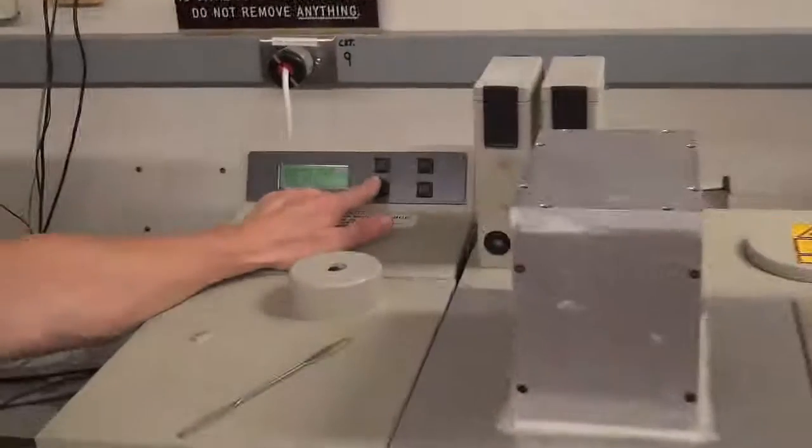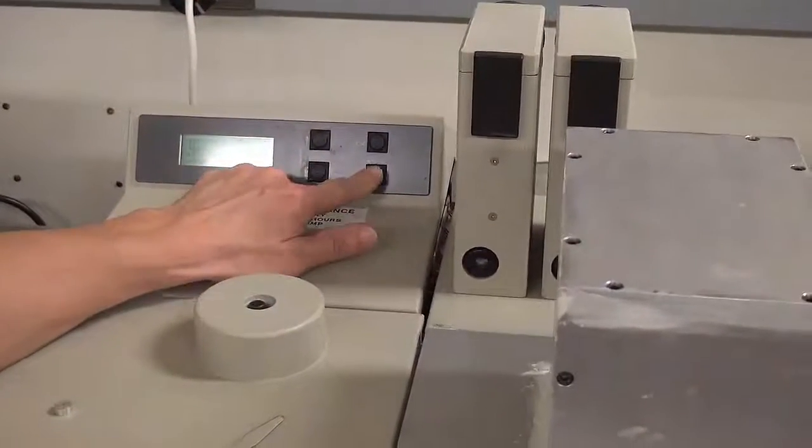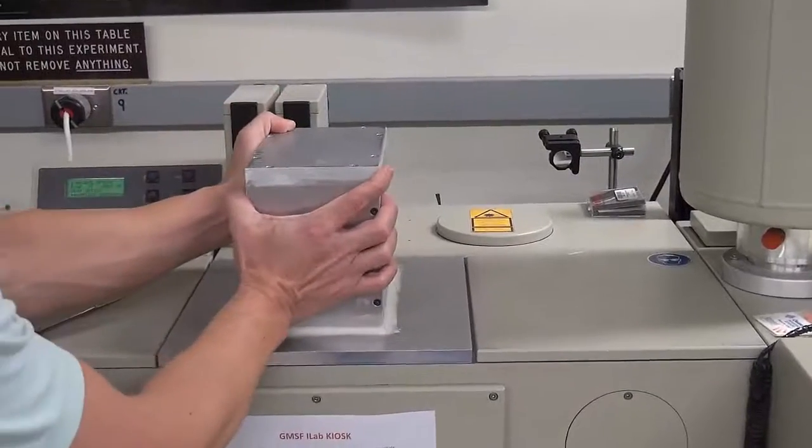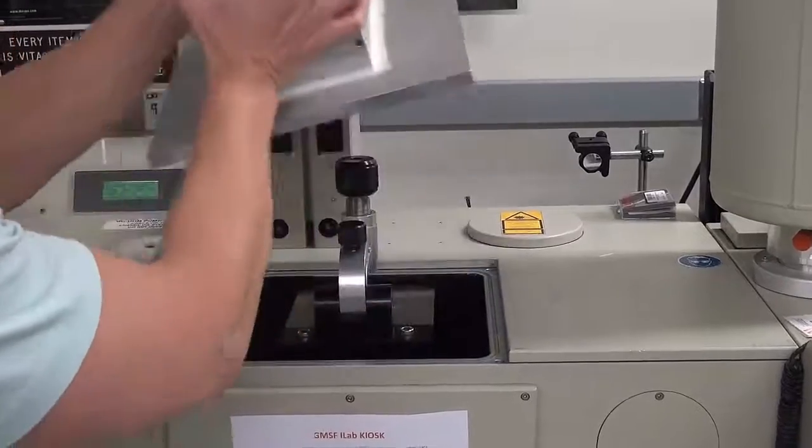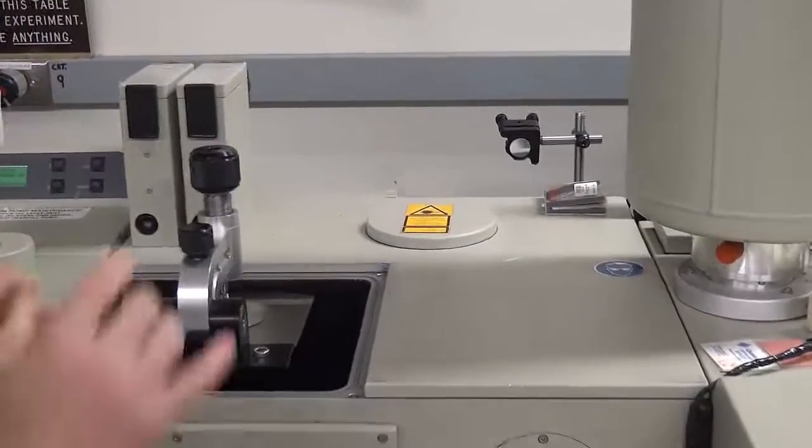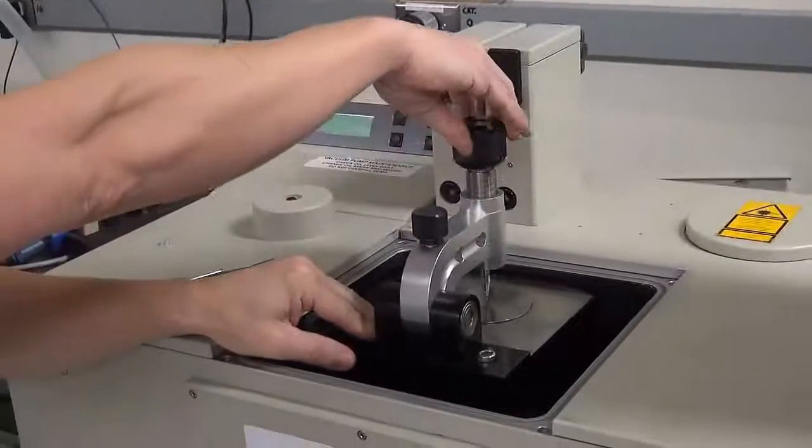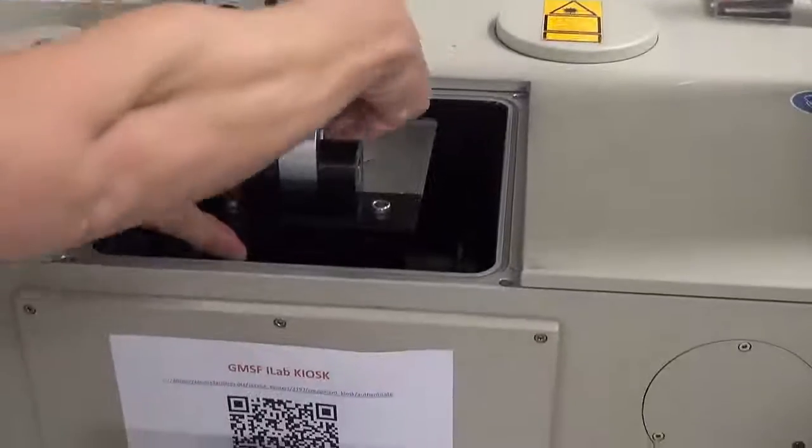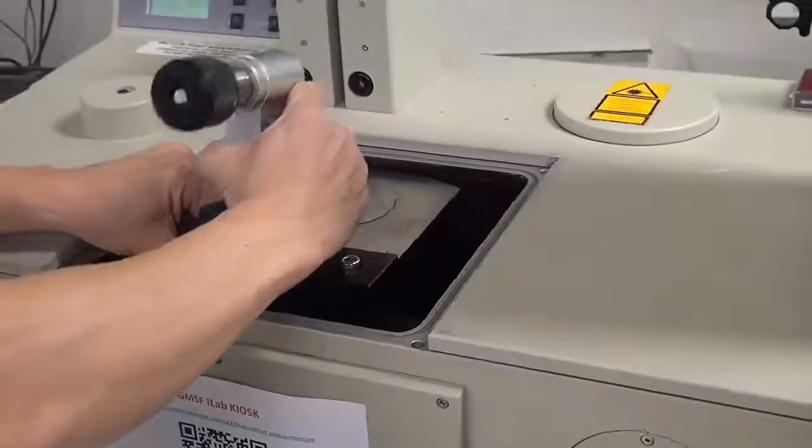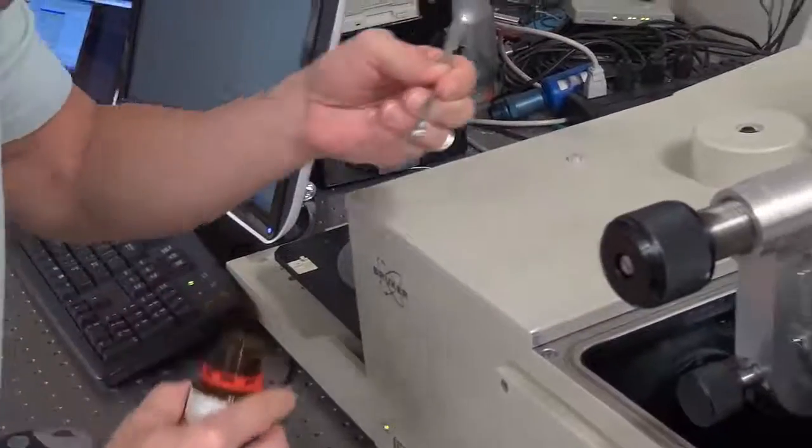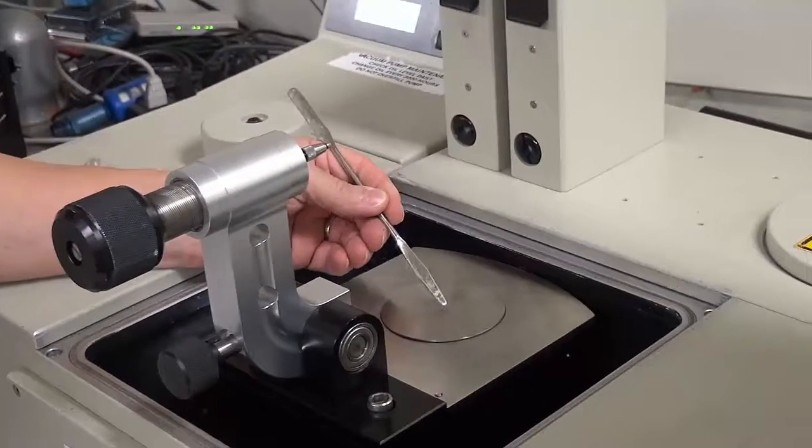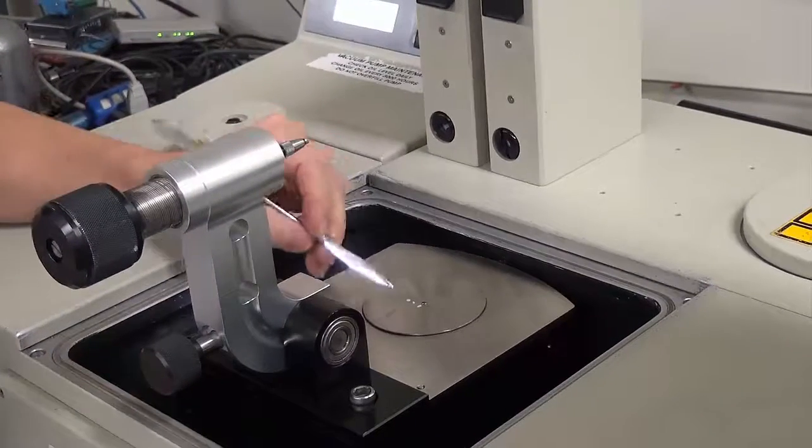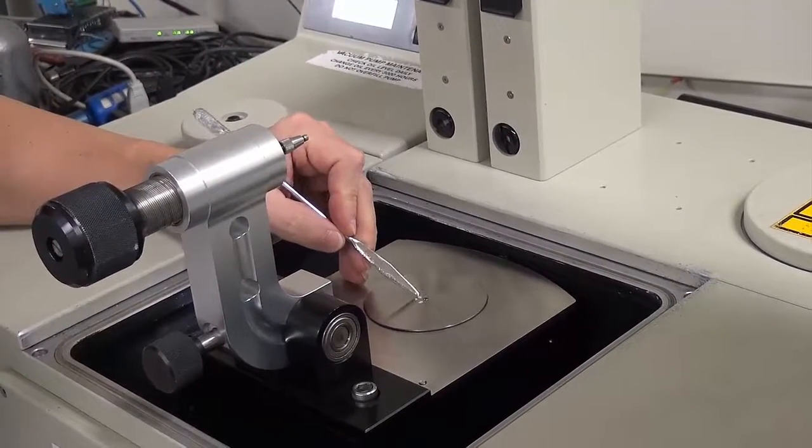Now you are ready to load your sample. So first, you're going to want to vent the system, and then after the system is vented, carefully lift the lid and place it on the table. You can load your sample without lifting the arm, but it is much easier to lift the arm first. Make sure to hold down the ATR arm when moving the arm.